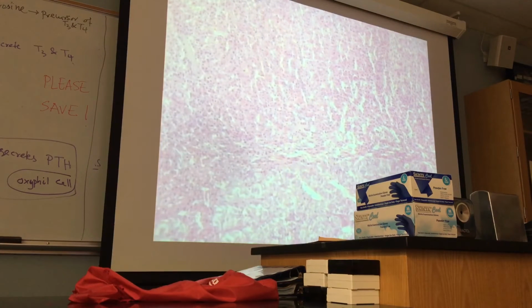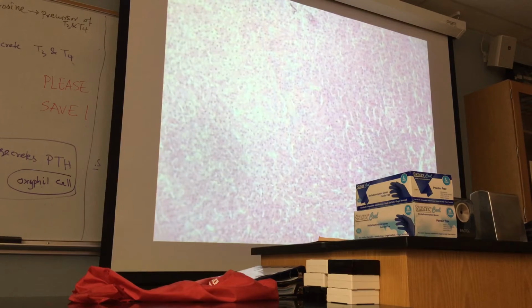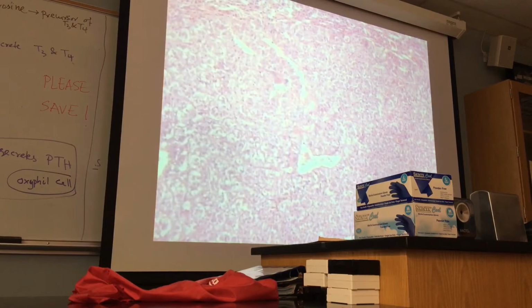Now, we will be getting into adrenal medulla. So adrenal cortex, one more time: zona reticularis, zona fasciculata, zona glomerulosa. This is the capsule. Now, we are in adrenal medulla. Adrenal medulla is made of these cells. These cells are called chromaffin cells.